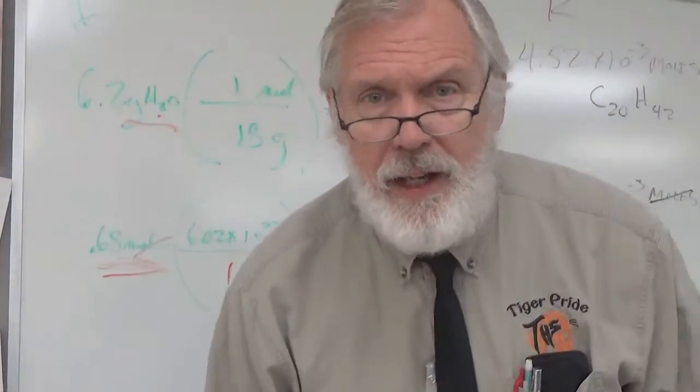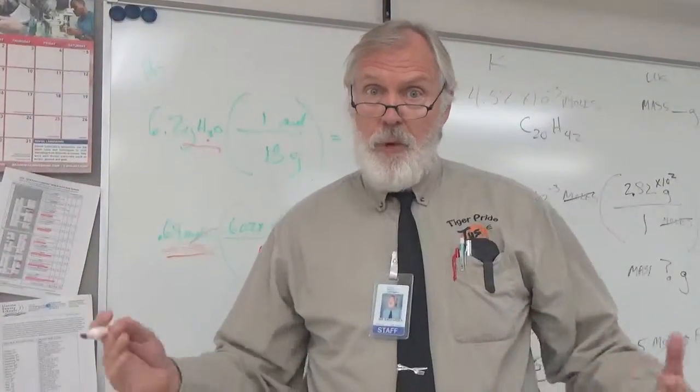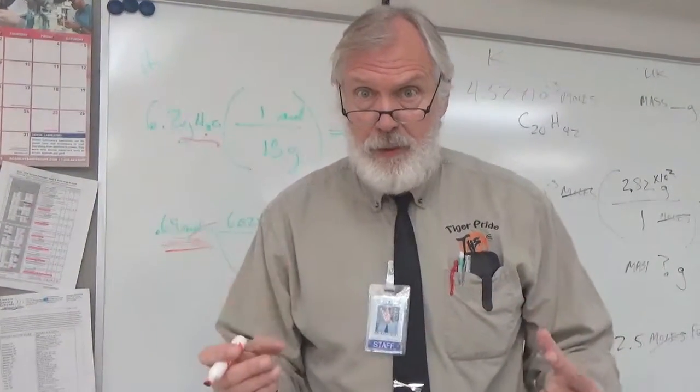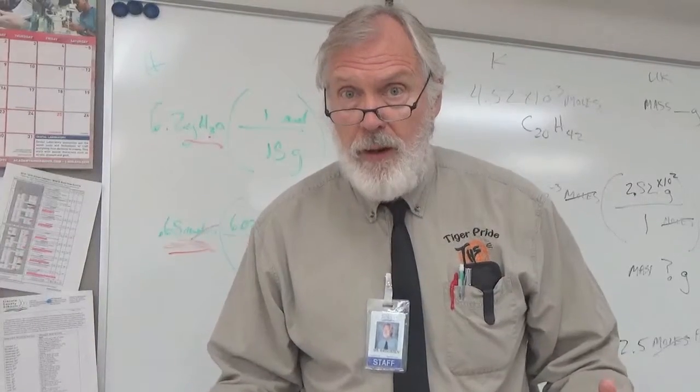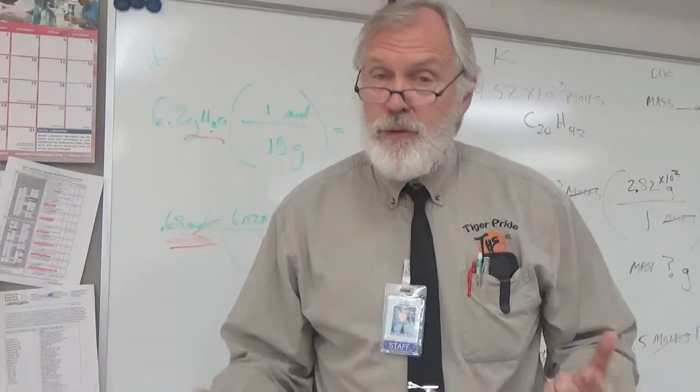You got how this is done, it wasn't that hard. And then you needed to tell me which one did we have more moles of in that 1 teaspoon, which was water, and which one did we have more particles of, which was water.